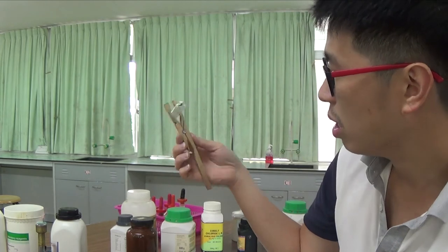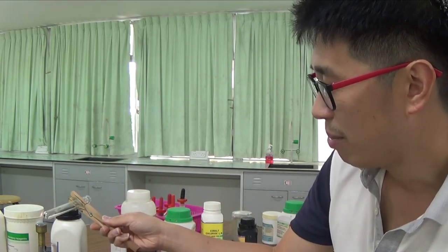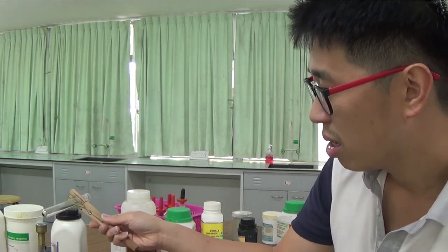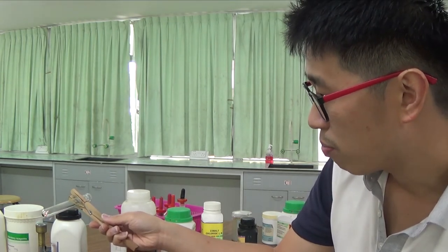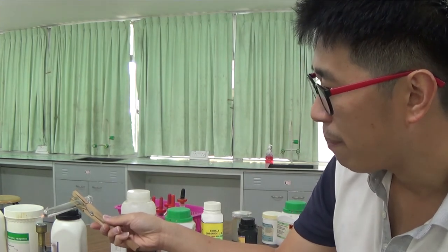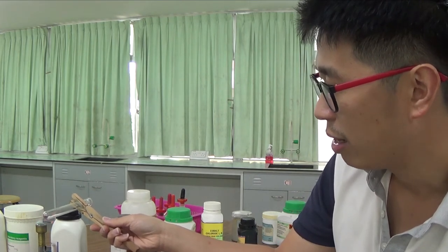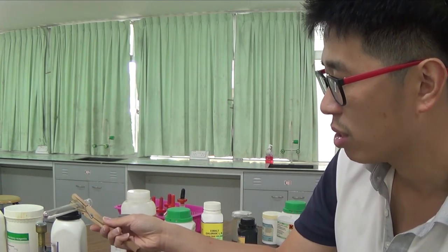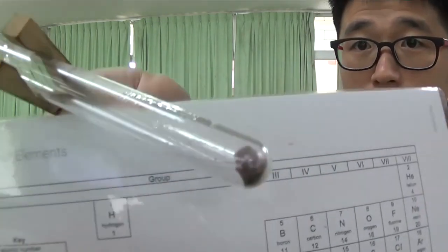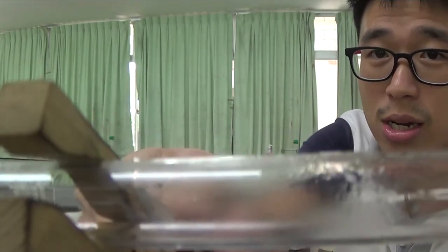Alright, so I'm going to heat the green solid now, and because it was a hydrated salt as we mentioned just now, not too surprisingly I get a colorless liquid forming on the upper part of the tube, and that again is an indication of the presence of water of crystallization, because even though the solid was green, you get condensation on the upper part of the tube, so that is not a green liquid.